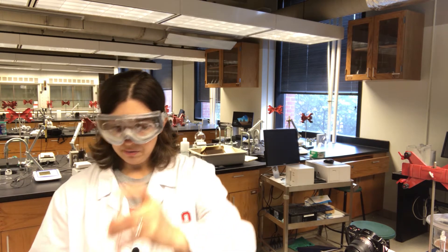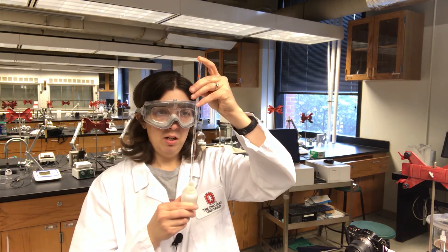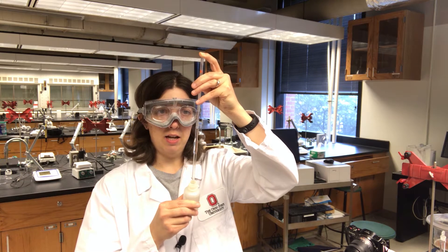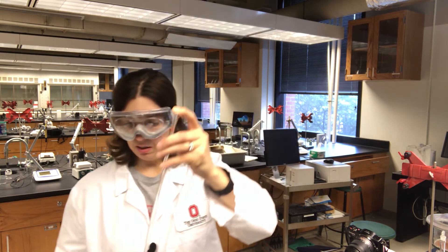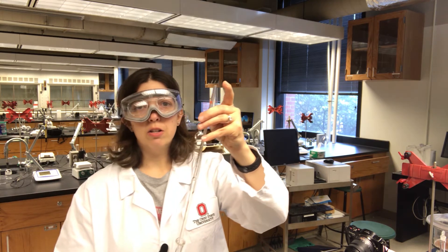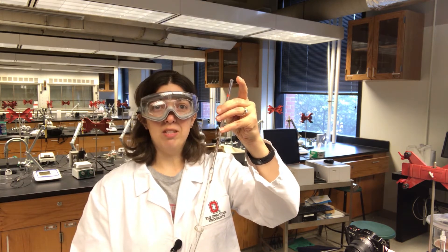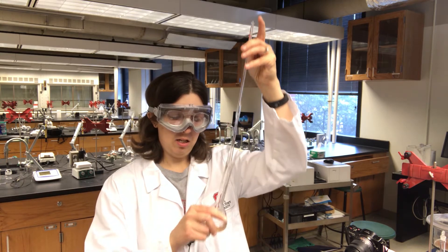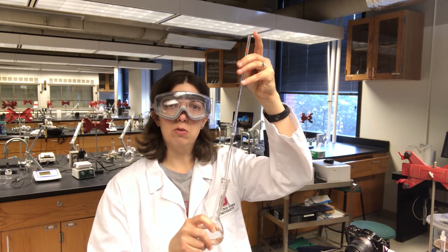All of our standards need to contain 2% ISA. So we need to be thinking about how we're going to prepare our standards so that they all have 2% ISA, because we're going to do serial dilutions from this concentrated solution.